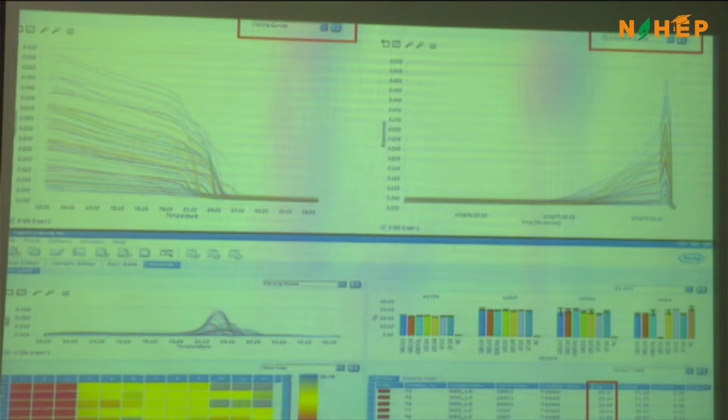And the third is a fluorescence curve. The fluorescence curve will tell you whether your sample is giving fluorescence or not, whether you are getting some data from that particular well or not. Every line you see here represents a well considered for your analysis.